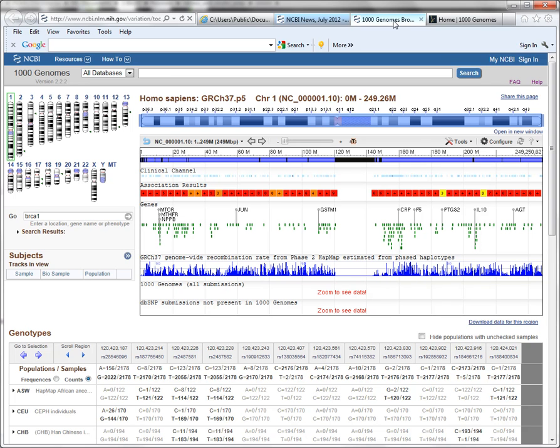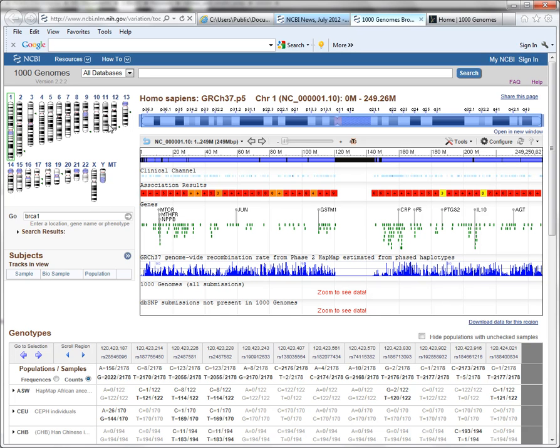This page is rather busy. It is created with a variety of different widgets, and so what I want to do is walk you through the main widgets, and then I'll go back and visit some of the additional options widgets.